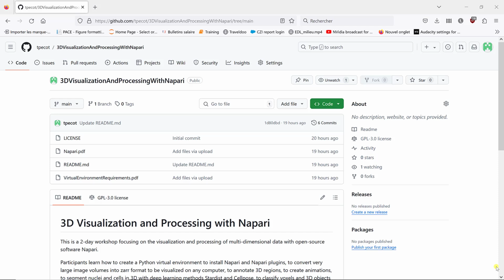When you use several packages together, you might face some incompatibilities between those packages. So it's really important to have an environment where all the packages you use, and all the code more generally, are compatible, so you can run your different programs. And when you create a virtual environment, you can install exactly what you need.